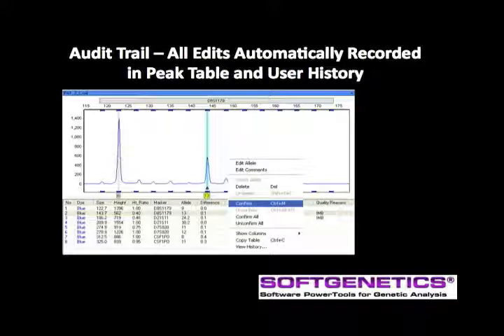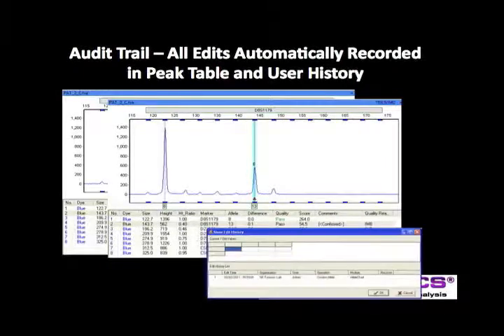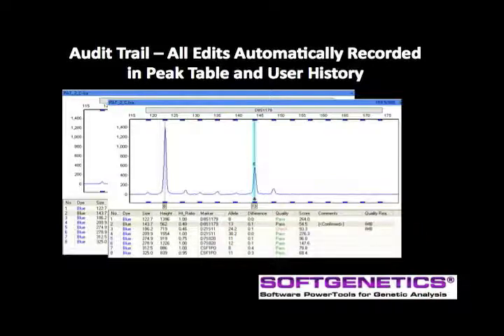If an analyst makes the determination to accept the peak, right-click and select Confirm or use the hot key Control-M. Comments may also be entered at this point. All actions and comments are recorded in the peak table and history, as with this example where allele 13 was confirmed.